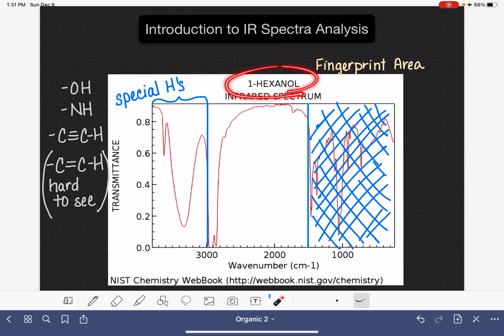We know because we know from the name of this that this is an alcohol, and we also know that oxygen-hydrogen bonds tend to give peaks that are very strong and broad. Not always, but that's definitely characteristics that we see here. Nitrogen-hydrogen bonds are also broad, they just tend to not be strong. So they could be medium or weak in intensity.